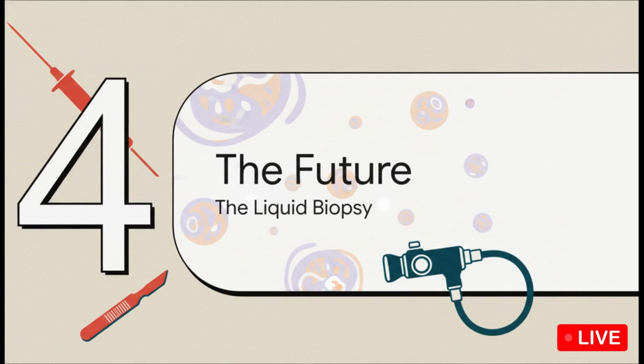But hang on, before we look to the future, we have to talk about what happens right after the sample is taken. Because honestly, getting the sample is only half the battle. A perfect biopsy can be ruined by simple mistakes. First, labeling. The container absolutely must have at least 2 unique patient identifiers. A mix-up is a disaster. Second, fixation. The tissue has to go into a fixative, usually 10% formalin, right away. This stops decay. A dried-out sample is useless.